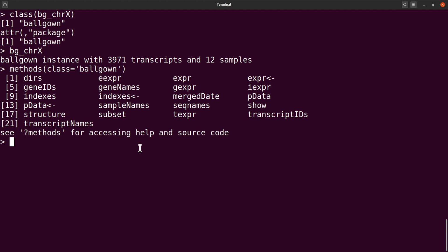So let's proceed. I'll also try to introduce certain things to beginners especially, so that you get a hang of the R syntax and how some of the libraries are used. So just take note of that. We are moving smoothly, and I will say good job to everyone who is also practicing. So let's continue.